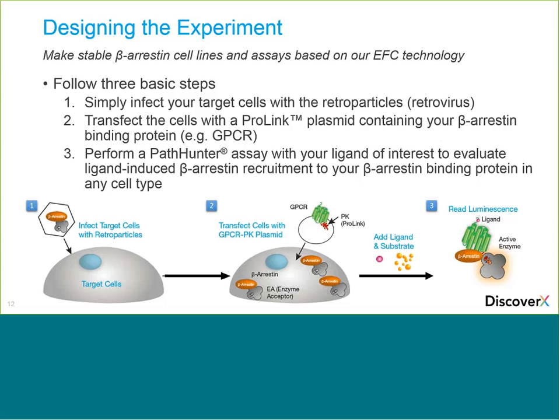we're going to look at, oops, I skipped one. Comparing different ligand responses in different species, so looking at receptor orthologs. One may want to do this to screen ligands for beta-arrestin recruitment prior to animal studies, looking at human versions of your receptor versus ortholog receptors in other species, like non-traditional species, for instance.